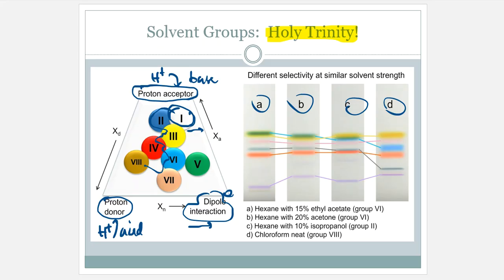And then in B, it looks like this purple band moves up from its starting point a little bit further than what lane A did for us. In lane C, it looks like the yellow has now bypassed the green. The pink is still there. The blue and the orange are really close together. I've got to be careful. There's a very slight color right here. You probably can't see it that well on your computer screen, but it's there. And then I get a purple one that moves up from the point of origin.